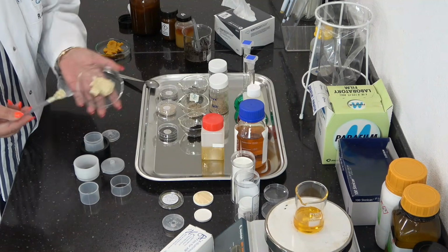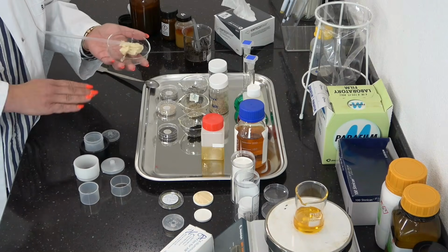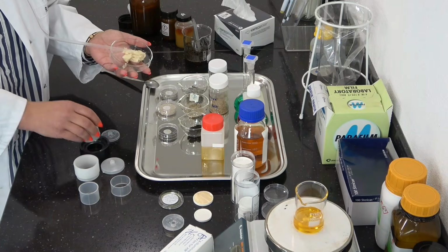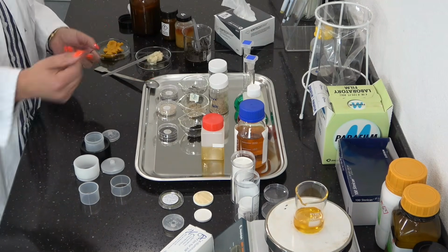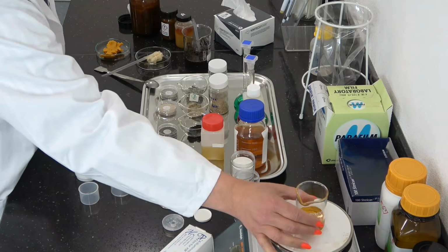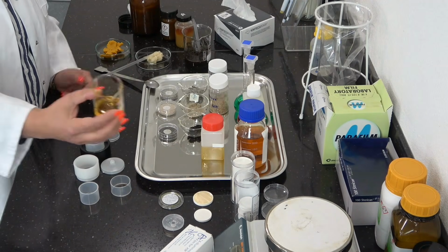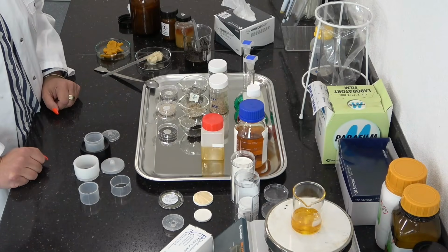This can also be put into the liquid cup, which is sometimes not very nice from the handling. Sometimes it's also not really possible to make it flat in the liquid cup. So this kind of sample could also be heated up on a heating plate to liquefy it and then poured into the liquid cup. So this is one solution. For sludges, maybe this is not always the best way.